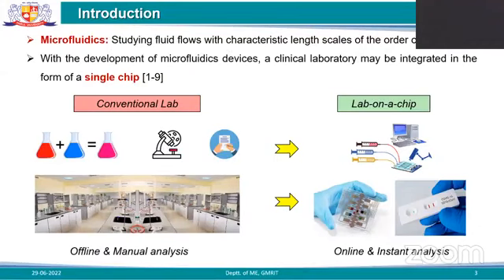Nowadays we are very much familiar with the COVID test and pregnancy test also. These are some types of microfluidic devices where the same kind of test has been conducted. The COVID test, we have seen very much in the last 2 years, and we are very much familiar with that device. It is one example of this kind of device.